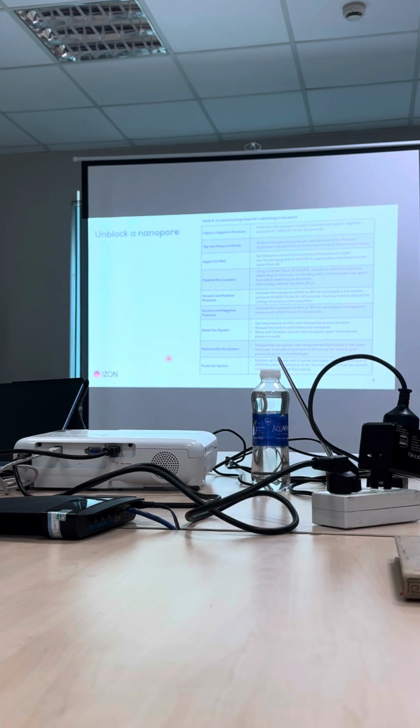And you may ask, so this measures the nanoparticles passing through the nanopore, whether large particles will block the nanopore? Yes, that's part of the troubleshooting procedure. So we provide guidelines for how to do the troubleshooting. So the training is mainly about how to unblock a nanopore when blocked events happen.